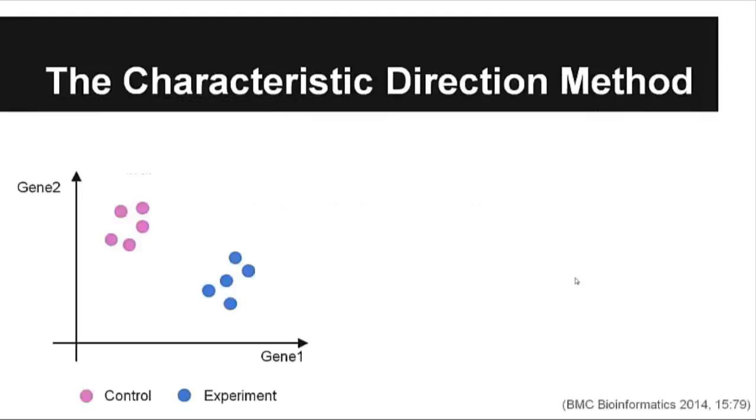So here we come to the first part, identify significant experiments. Actually, the method I used is an adaptation of the characteristic direction method our lab published this year. This is a method invented by Neil Clark in our lab. I just tailored this method specifically for the LINCS data. Here is a toy example to briefly explain this method.